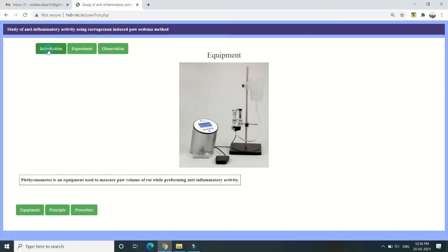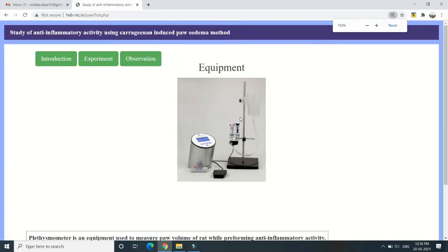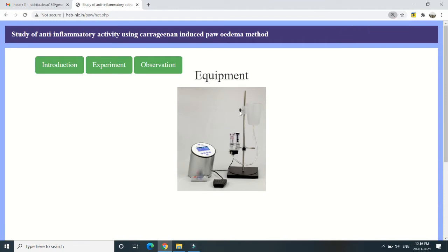We can see all parameters: the introduction part, experimental part, the observations we will record, equipment details, principal part, and procedure part. All details are available in this X-Pharm software. Let us see one by one, starting with the introduction. The platysmometer is an equipment used to measure the paw volume of the rat while performing anti-inflammatory activity, assessing the edema produced in the rat paw.